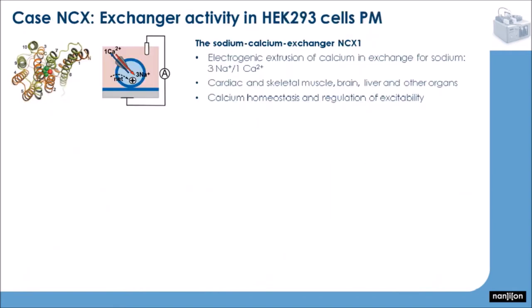So finally, I would like to show you a little case study to give you an impression of what the technology is capable of. I chose NCX, the sodium-calcium exchanger, for this. Maybe you know that NCX is triggering an electrogenic exchange of sodium against calcium in a stoichiometry that yields a current flow. It's expressed in cardiac and skeletal muscle, in brain, liver, and some other organs. And it's very important for the calcium homeostasis and also the regulation of excitability. So it's a very important protein. It's also interesting for pharmacology, but also in physiological investigations, it's still interesting.